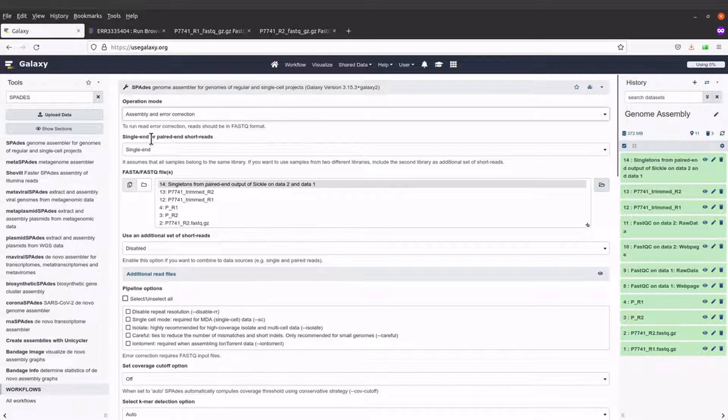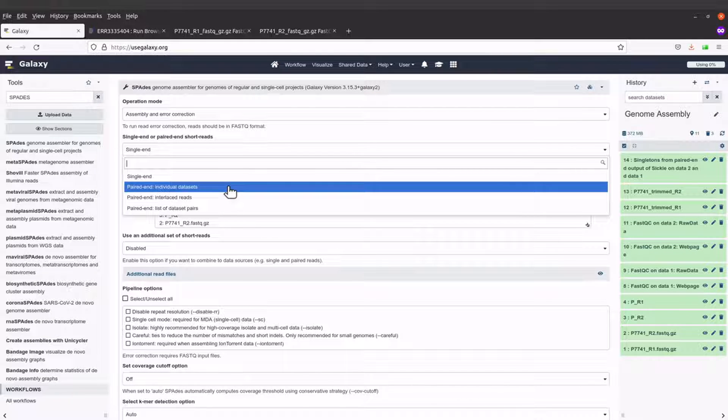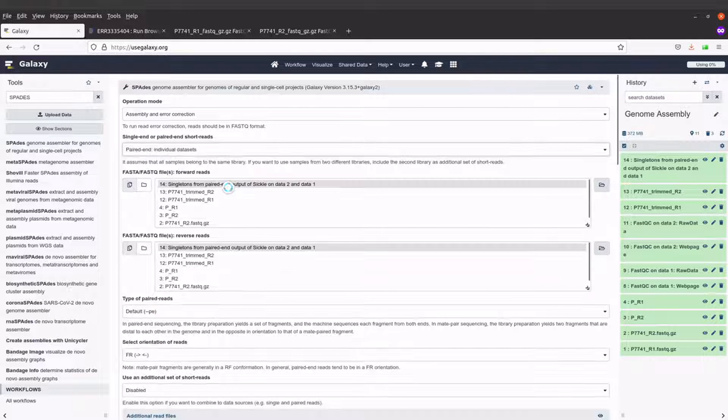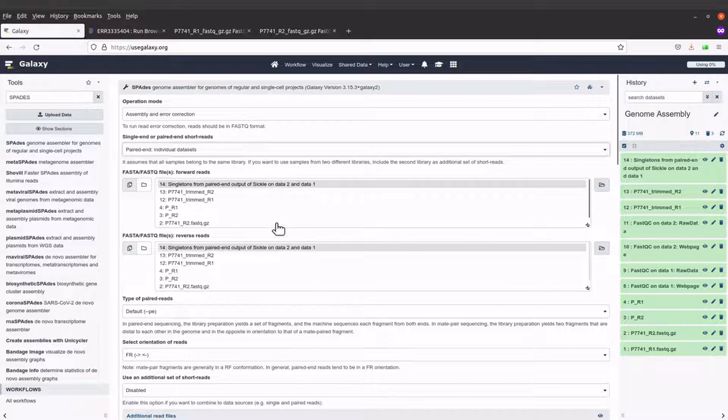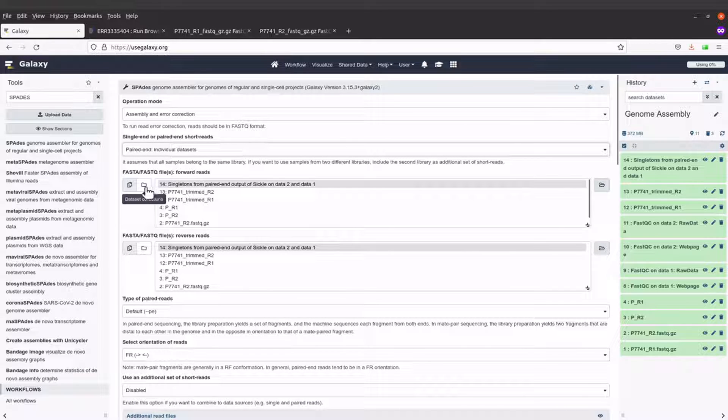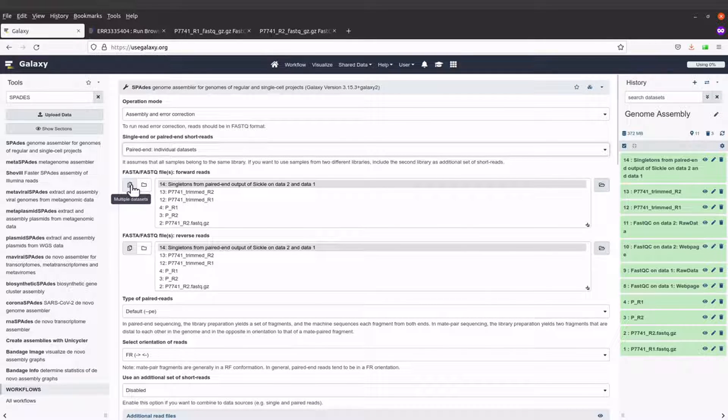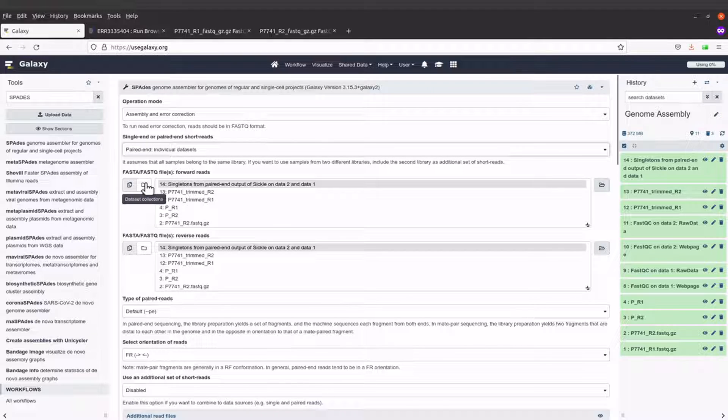When I come here to single or paired-end reads, I'll select paired-end and individual datasets. Then when I come here, I'm supposed to choose the data that I want.